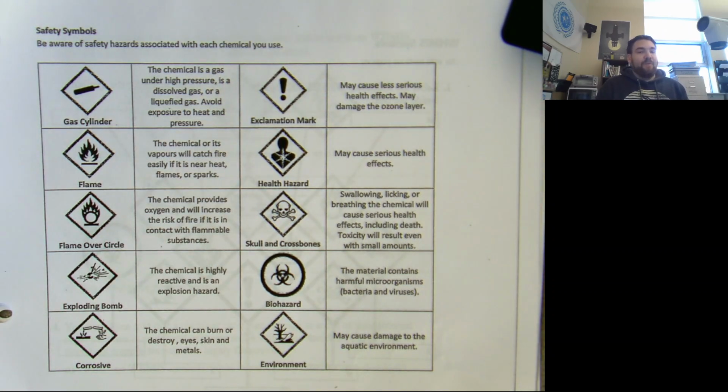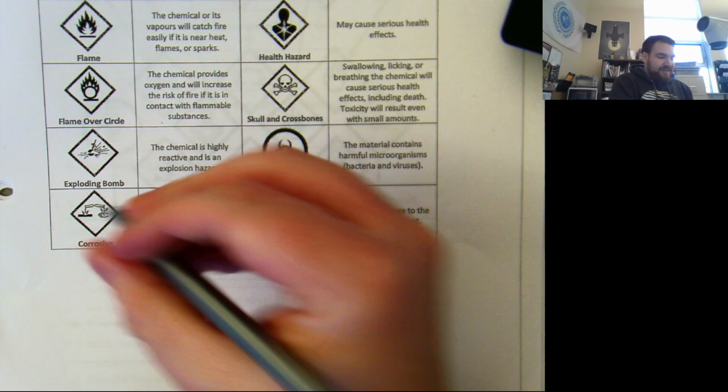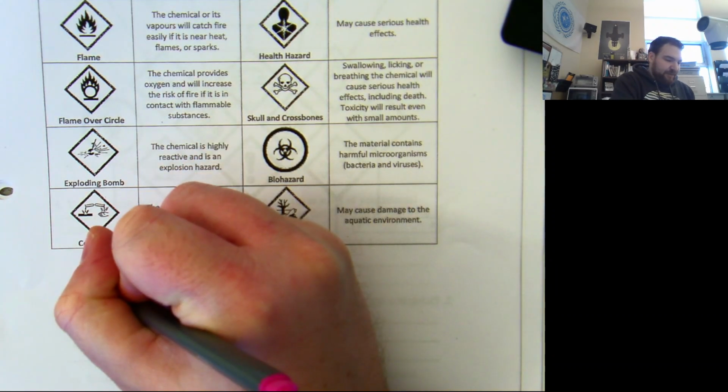These symbols have a name. What is it? Five letters, starts with a W. Does anyone? Yes, someone remembers. WHMIS. These symbols have a name. They are connected to the WHMIS system.